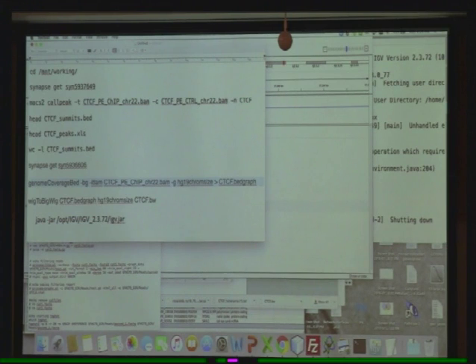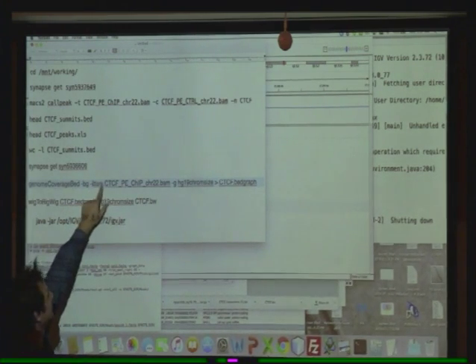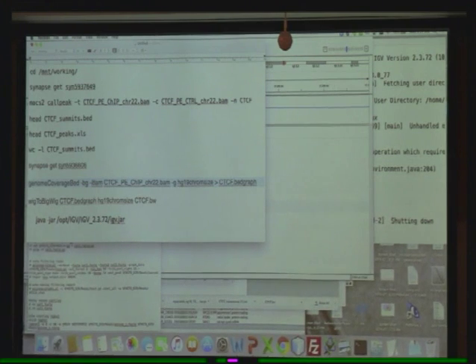Genome coverage bed.bg. No, you need a dash. Good. Okay, guys, really every single character has to be right, you can't miss out these little dashes. You can't have anything else in here. It's tab complete, because it actually says it's there.